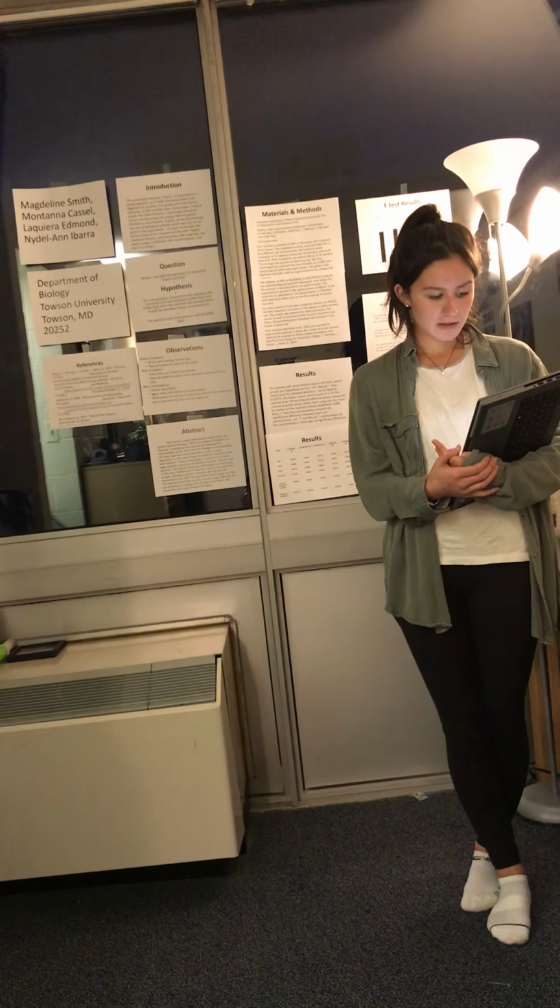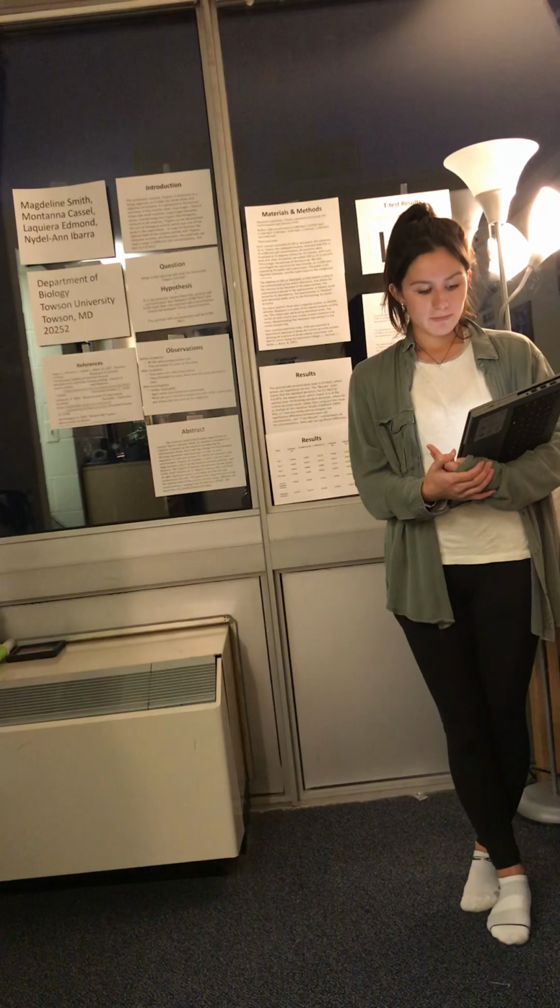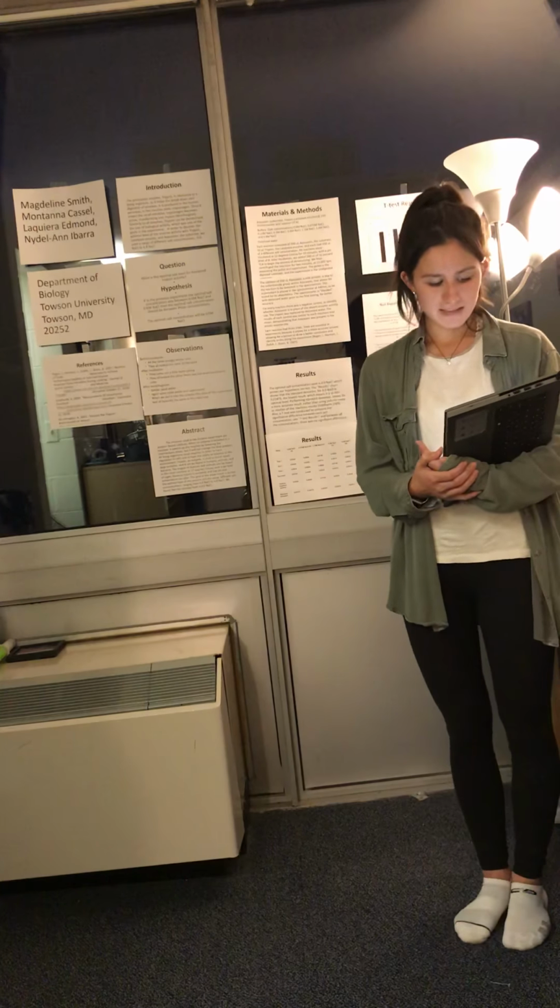Similarly to temperature, the normal pH level inside a human is around 7.35 to about 7.45, and so that is why we used 8 as our pH level. This allows for us to copy the conditions of the human body in a lab instead, and it gives us a better environment. It allows for the activity to be more precise as well.